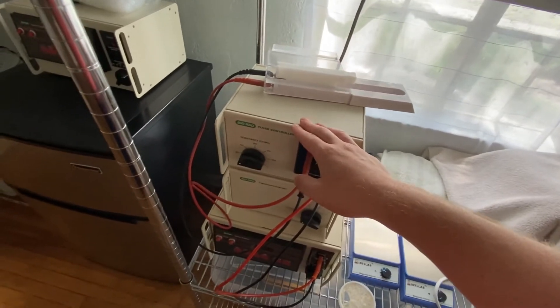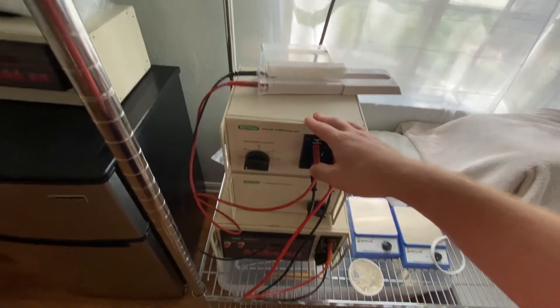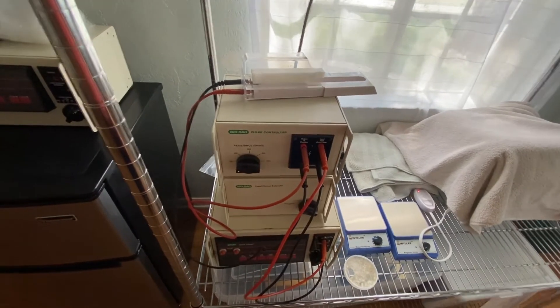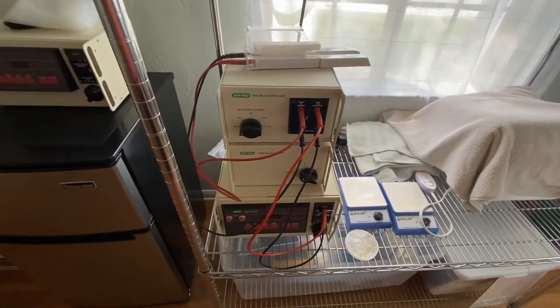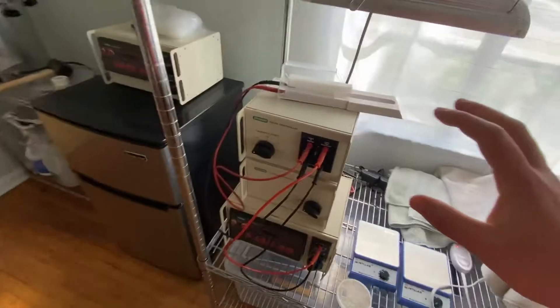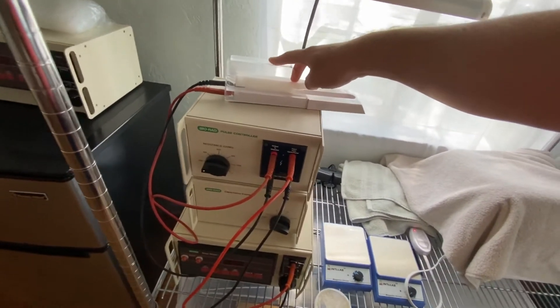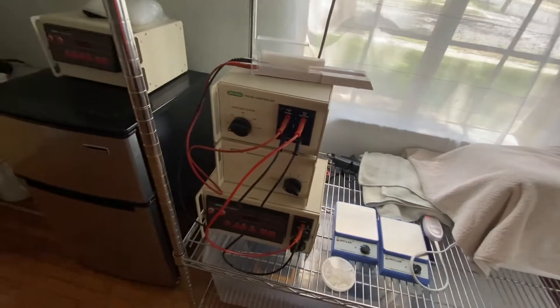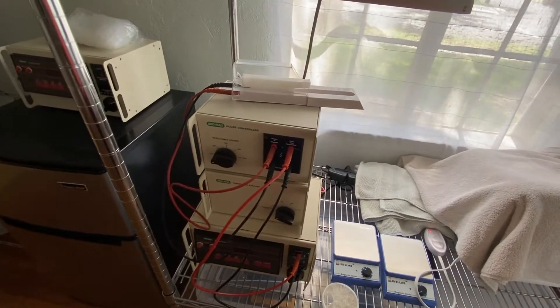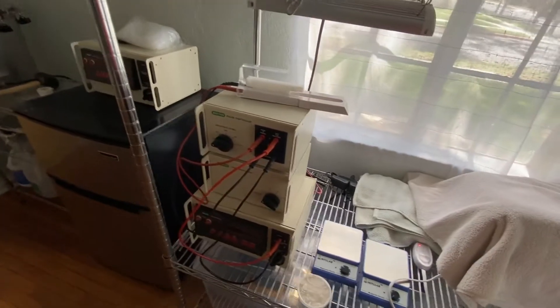The agrobacteria is kind of expensive. I'm deciding whether to get three vials for $150 plus $50 shipping, or six for a little over $300 plus shipping. I convinced one vendor to sell me a half order to help save on costs. They'll send me three aliquots of agrobacteria, so I don't have a lot. One of them I'll probably just streak onto a plate so I always have some to work with. They come electro-competent already, so I don't need to worry about prepping those.